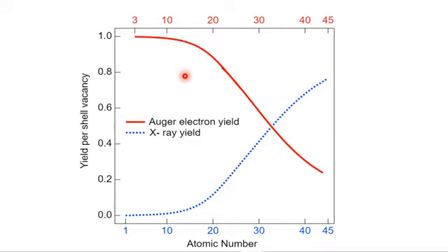In case an atom has a lower atomic number, then there will be fewer shells, and the tertiary electron ejected due to K alpha X-rays will be easily ejected without interacting with other electrons present in the higher shells, and in this way the ejected electron will be easily removed from the atom as an Auger electron. So this means that Auger electrons can easily be produced from an element with a lower atomic number. This is a schematic representation.